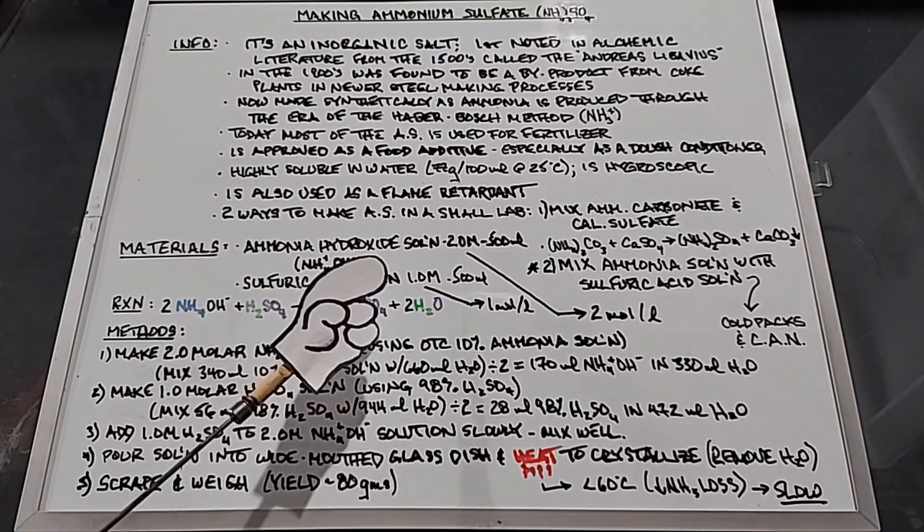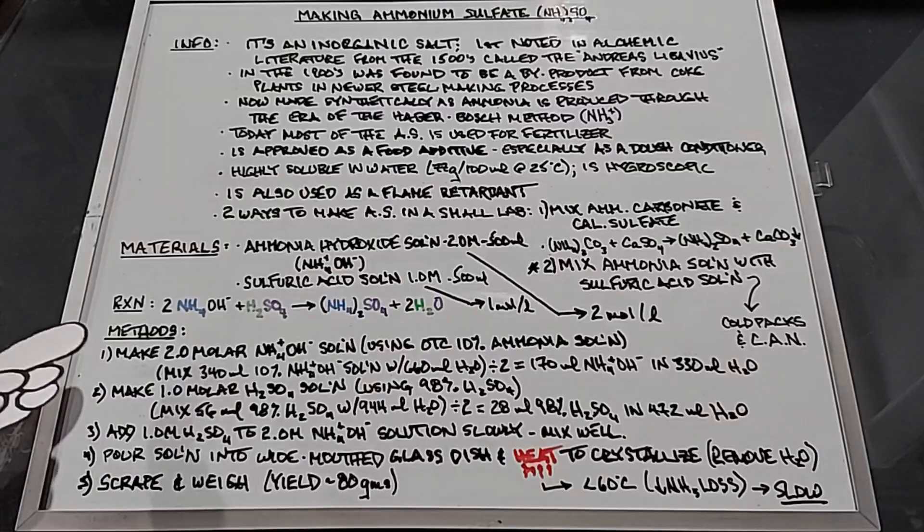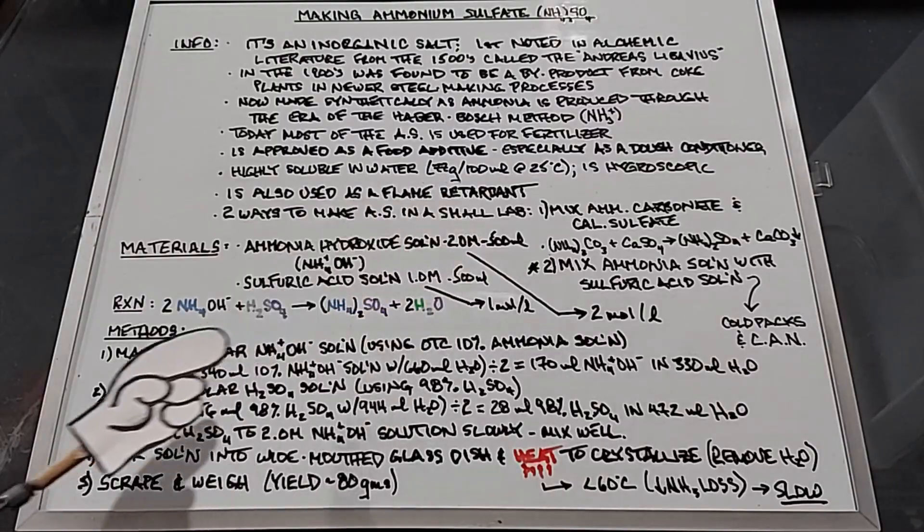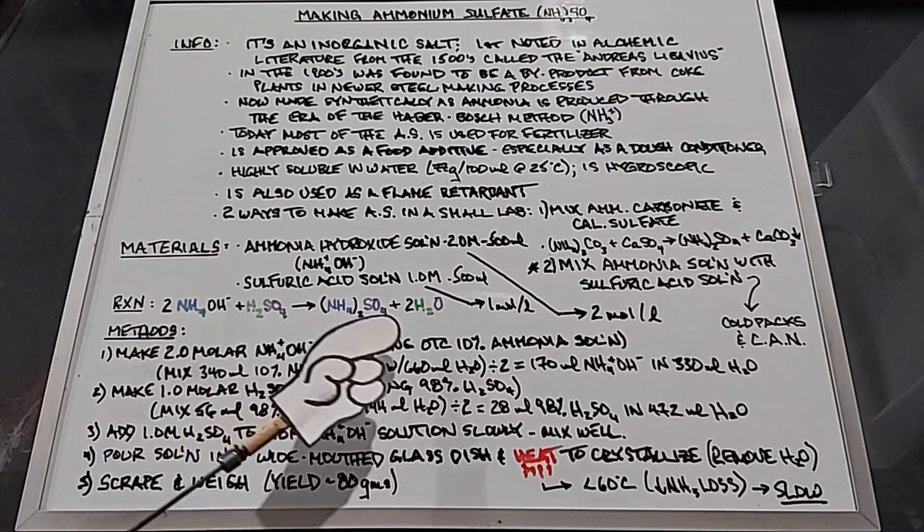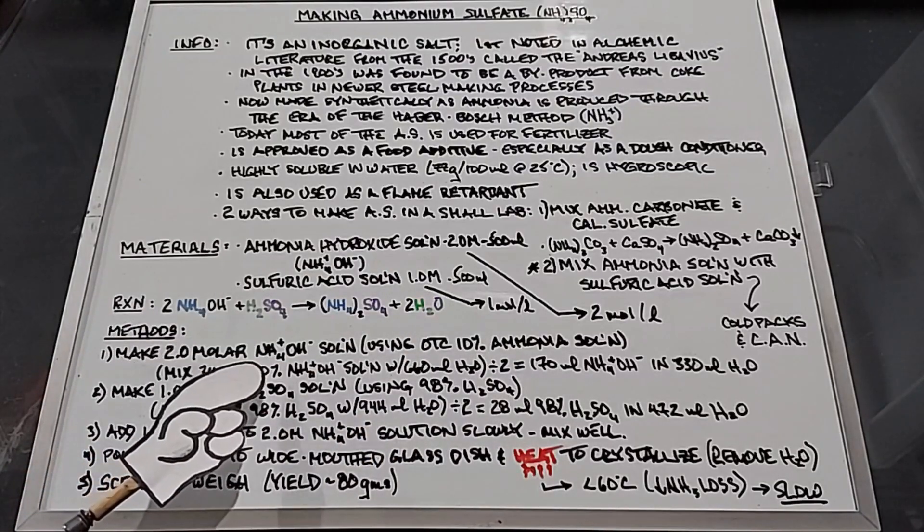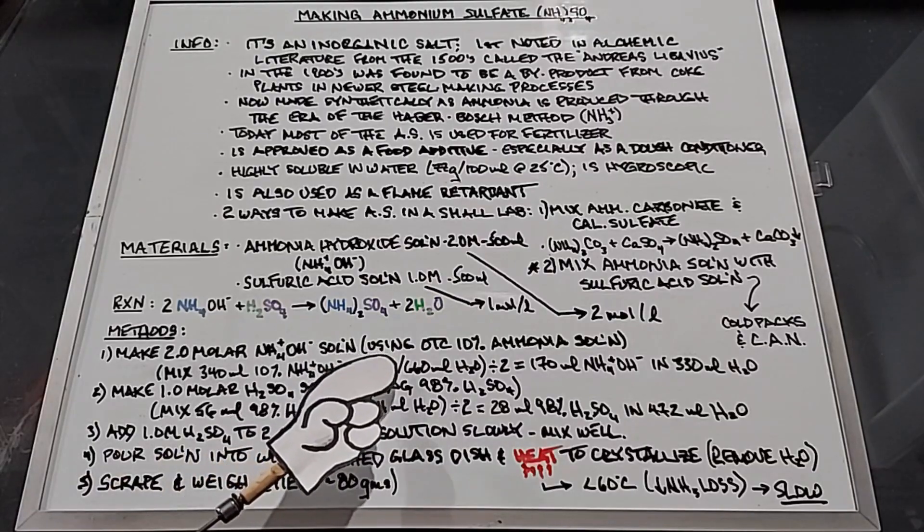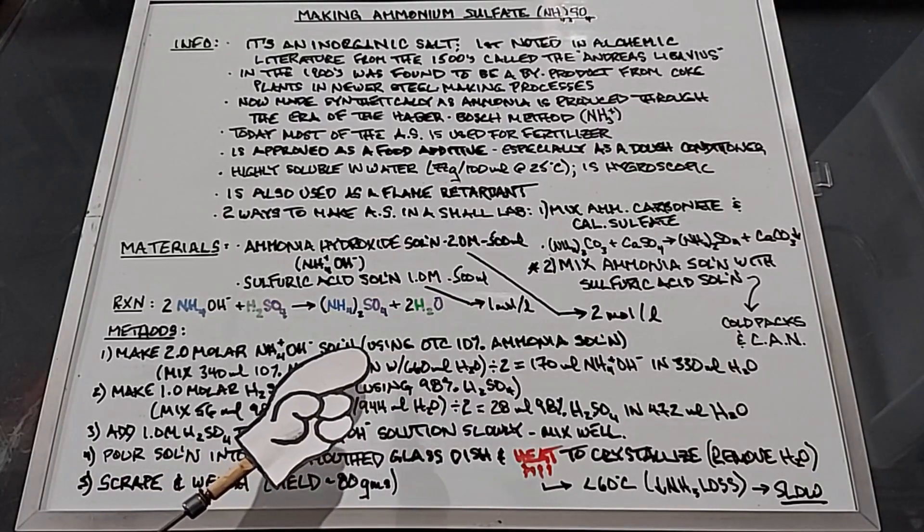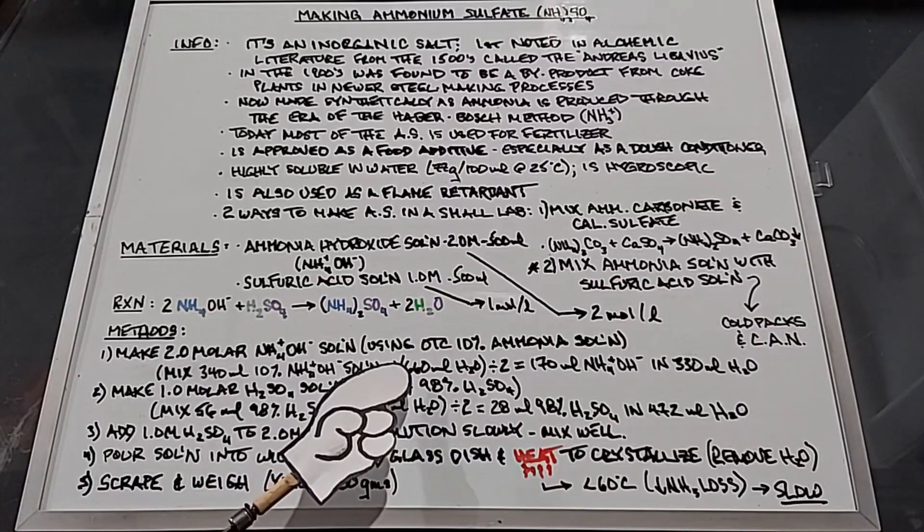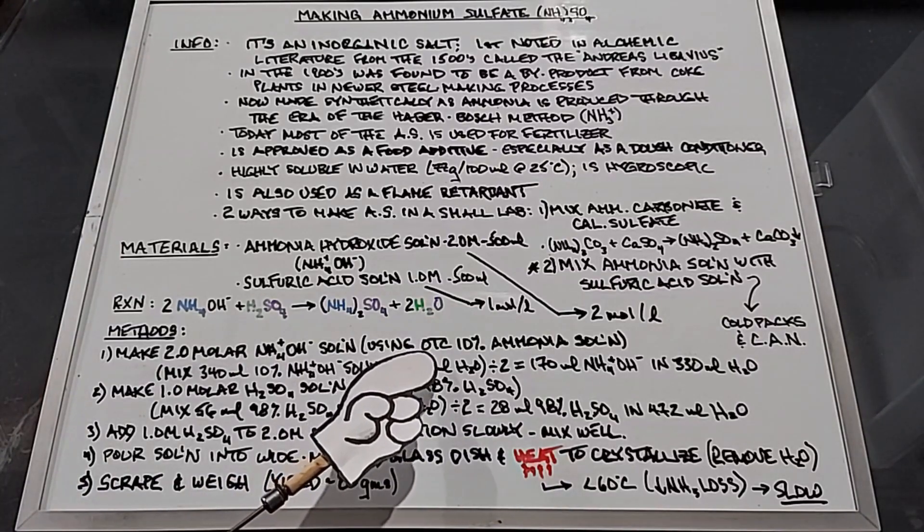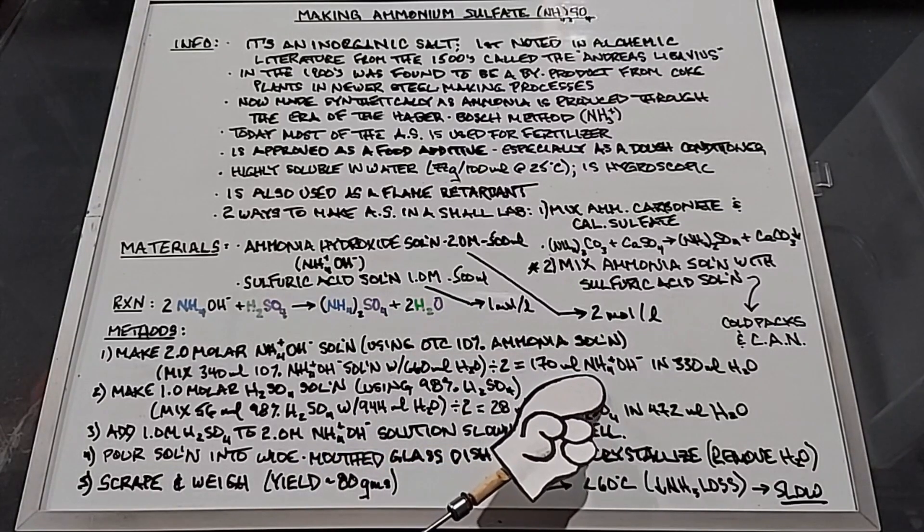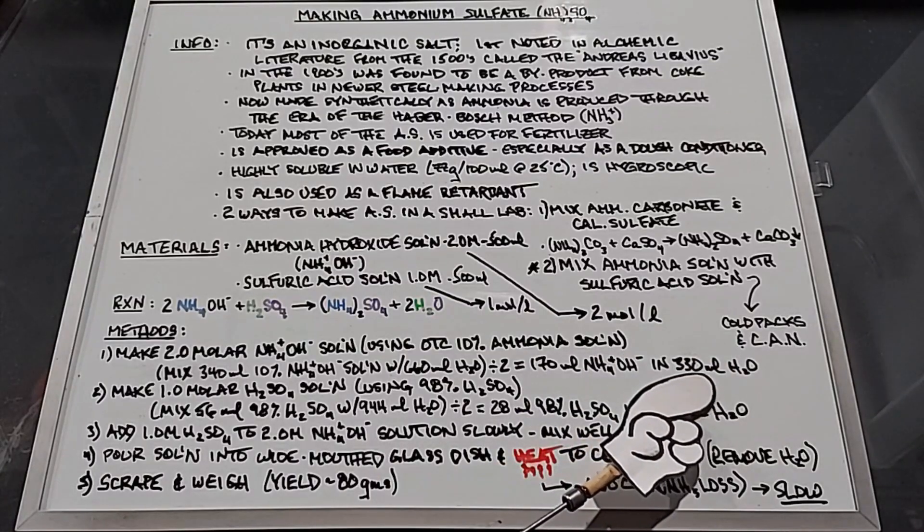In our methods here we're going to make a two molar ammonia hydroxide solution. To make this I'm using over the counter 10% ammonia solution. We want to mix 340 milliliters of a 10% ammonia solution with 660 milliliters of water. Because I only want to do 500 milliliters, I'm going to divide it by two, so we need 170 milliliters of the 10% solution mixed with 330 milliliters of water.